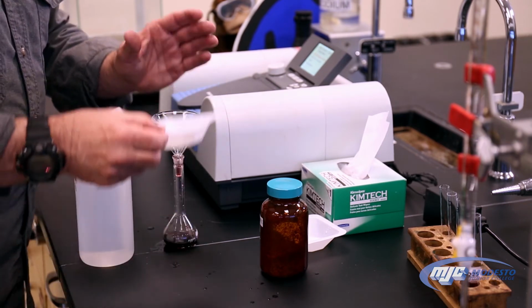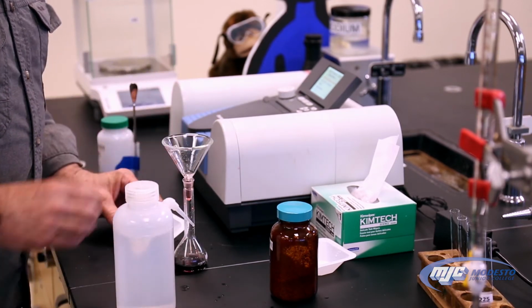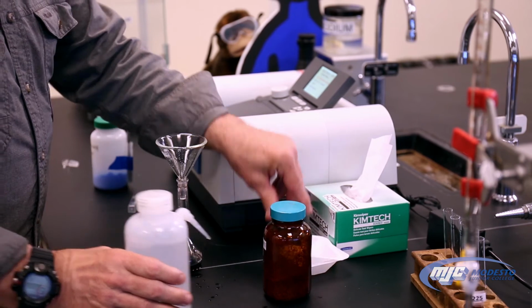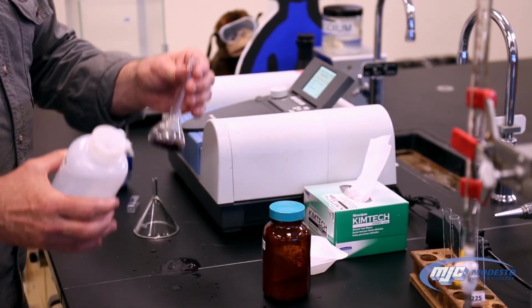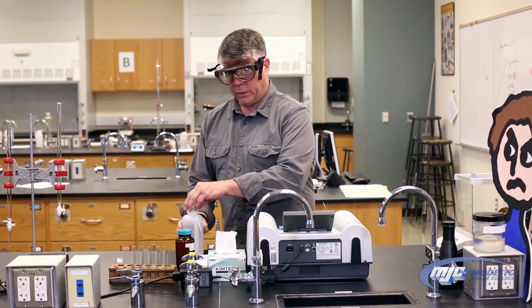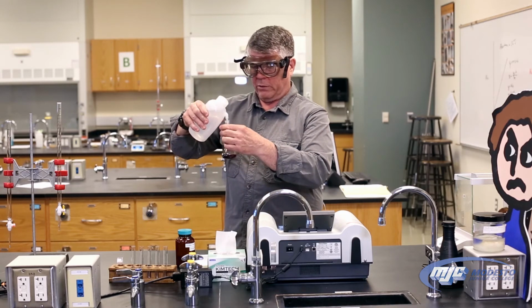We're also going to rinse off this weigh boat, make sure we get all that in there. All right, now that we have 2 compounds in there, we're going to add some deionized water, a little more than halfway. Start dissolving this. Once we get everything dissolved, then we can fill it up to the line, with the meniscus just touching the bottom of that line.